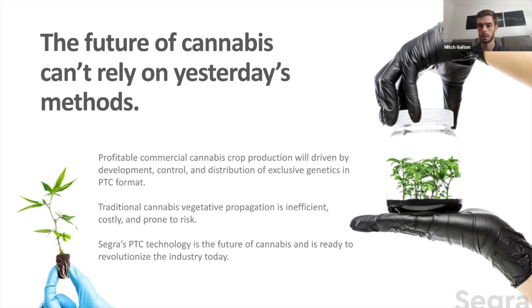Yeah, sure. We had an interesting one come in about identifying what the meristem looks like in cannabis, and specifically, the two sets of small leaves showing at the internode. What do they look for to identify the meristem when actually obtaining it?